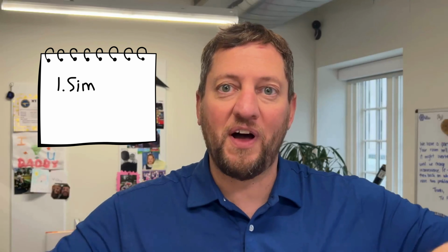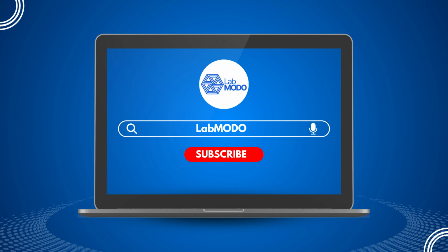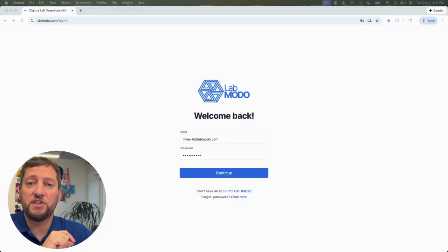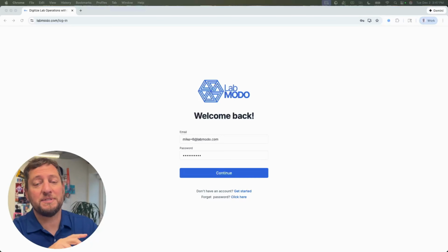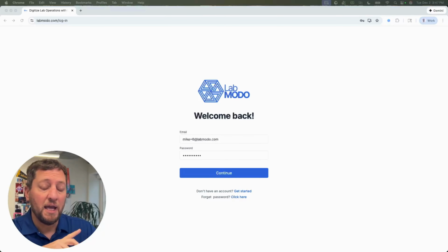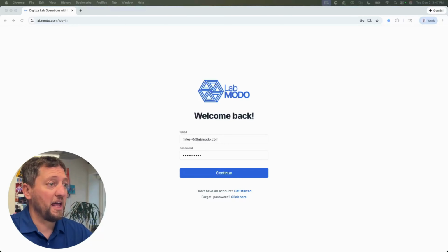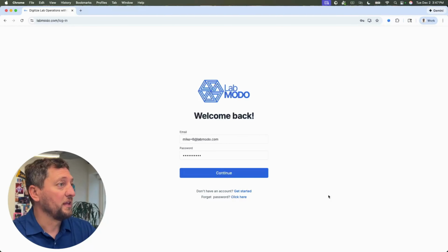Today we're talking about proficiency testing, how you can simplify and automate using LabMODO. Successful proficiency testing management in your lab comes down to two things. One, do we miss any dates or any deadlines? And two, do we have access to the information we need? We're going to talk about how we solve that now with LabMODO.